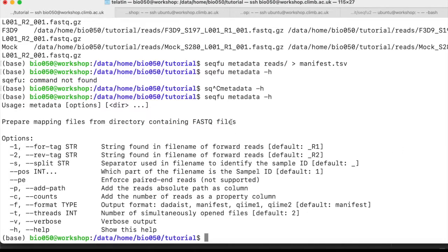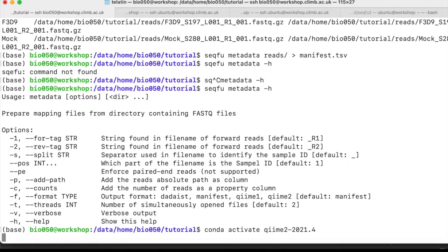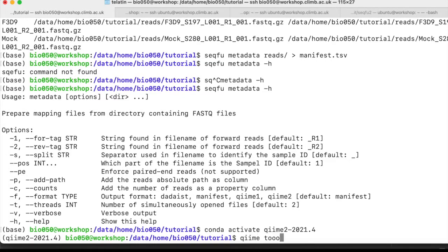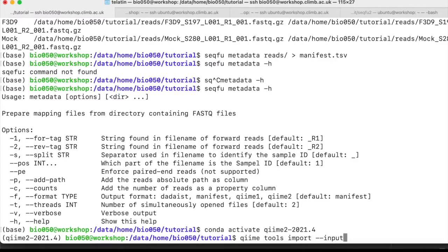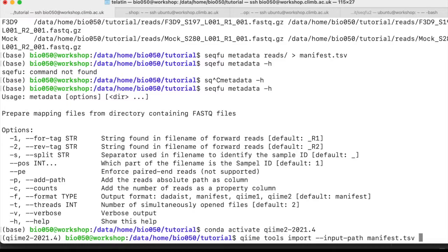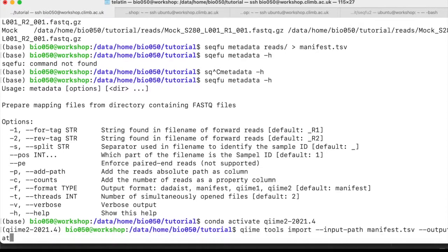Now we can use another command to import the reads. So we need to activate our QIIME2 environment again. And again, qiime tools import --input-path. In this case, our input is no longer the folder with the reads, but the manifest, because in the manifest, then QIIME will find also the absolute path to the reads.